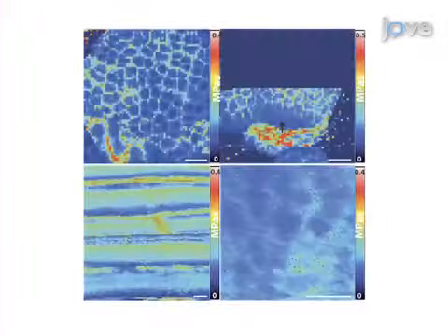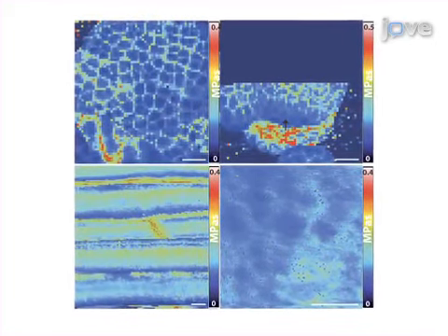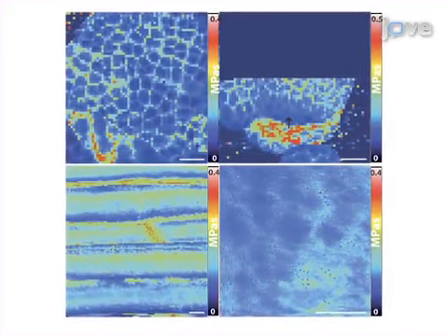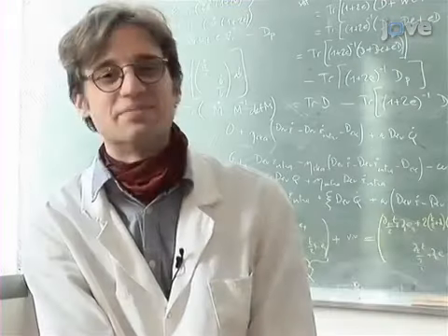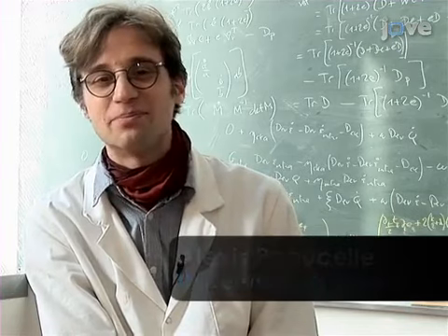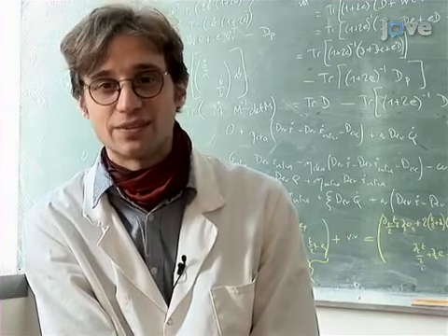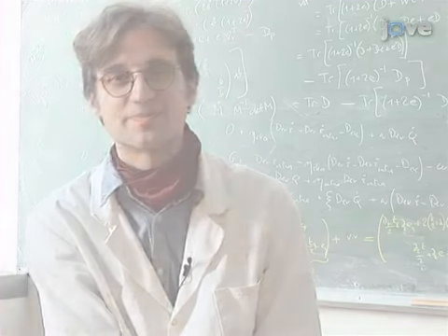Ultimately, data analysis and measurements of the apparent Young's modulus of cell walls generate a mechanical map of the properties of cell walls simultaneously at subcellular resolutions and across entire regions of tissue. The main advantage of this technique over existing methods is that it can measure mechanical properties of the cell wall simultaneously at the subcellular resolution and over entire regions of the tissue.